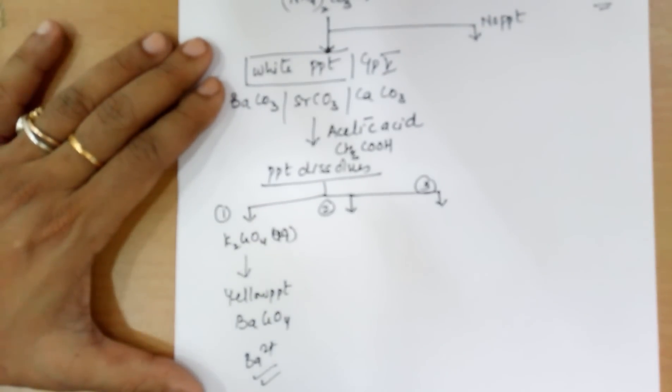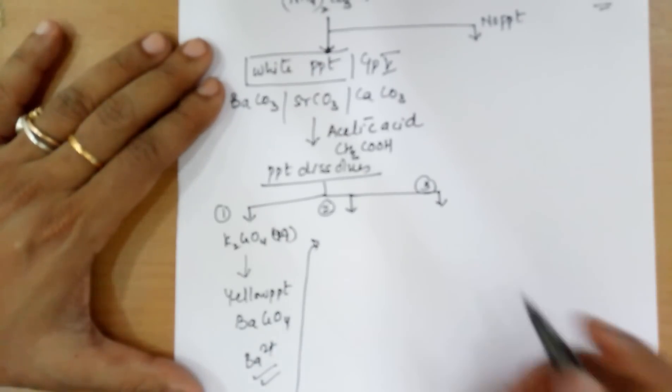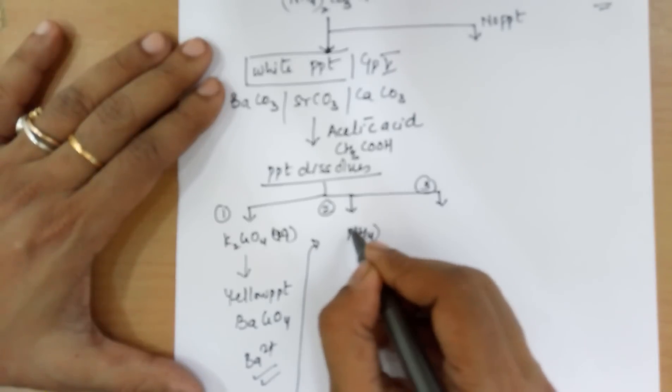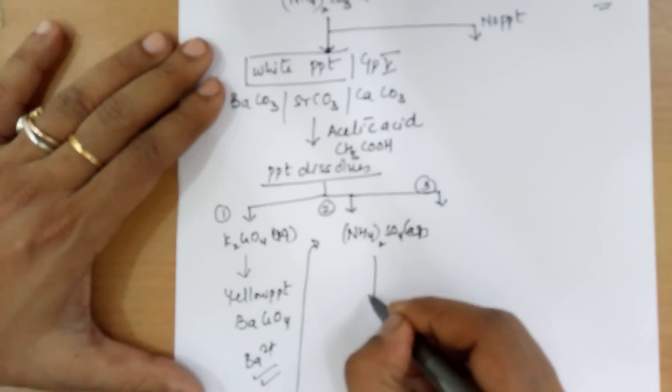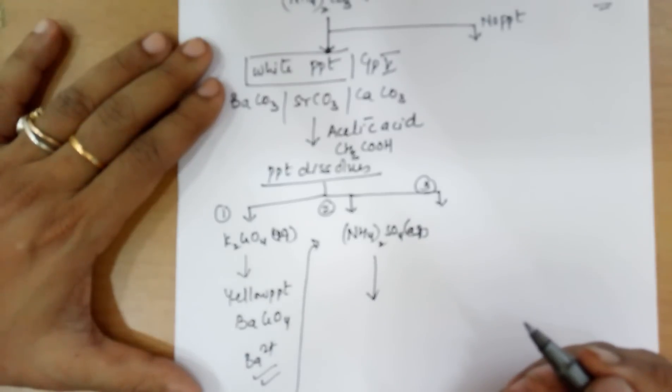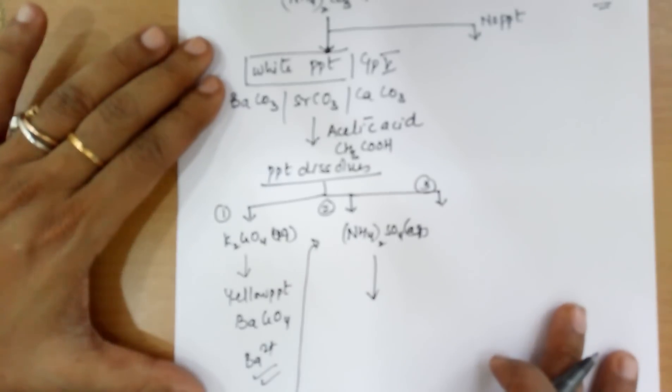If you don't get this, then you proceed for the second part. In the second part, you need to add ammonium sulfate solution. Wait for some time. Shake the solution a bit. It takes around 5 minutes for this PPT to come.